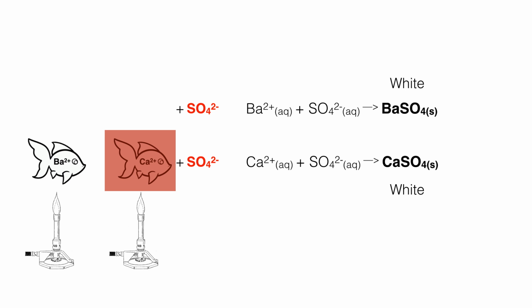The calcium ions will absorb heat from the Bunsen flame. The electrons in the electron shell will become excited, they absorb energy, but then the energy that they've absorbed they will also release as the electrons fall back down toward what we call a ground state. And that energy, the wavelengths of light that are emitted as those electrons fall back down, are visible to us in the red area of the colour spectrum. So calcium ions release a red colour when they are exposed in solution to a flame. Barium ions conveniently release a green colour spectrum. Not so convenient if you're red-green colour blind.